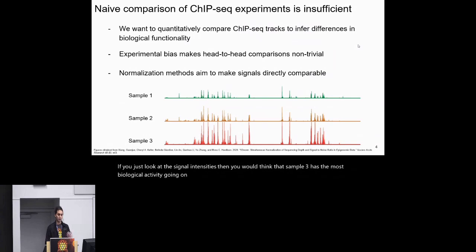But what could also be going on is that the technical noise is what's causing all the variance between the different experiments. And this actually ends up being the case here because these regions essentially focus on a subset of the genome which exhibits pretty uniform activity throughout and across different cell types. And so everything that you're observing here is just the result of technical noise.